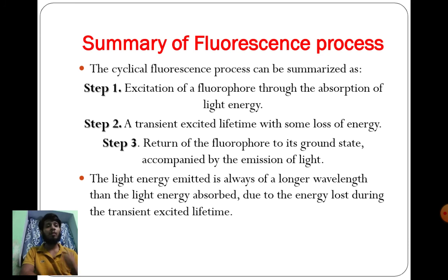Light energy emitted is always of a longer wavelength than the light energy absorbed due to the energy loss due to the transient excited lifetime.